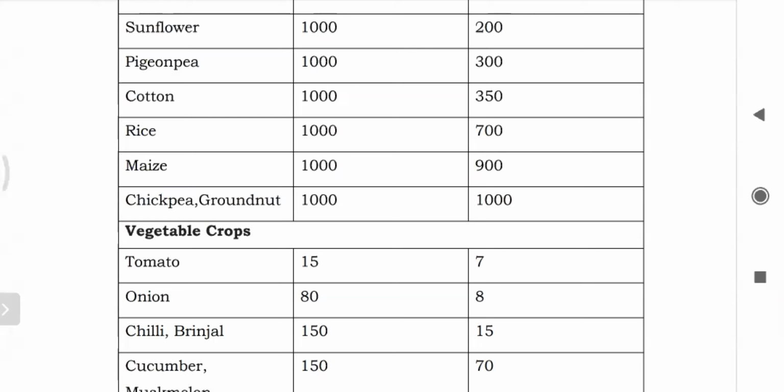So this is an important concept. Depending upon the size of the seed, you have to give the quantity of seeds for examining the seed quality and other tests, fulfilling all the criteria of the seed testing procedures.